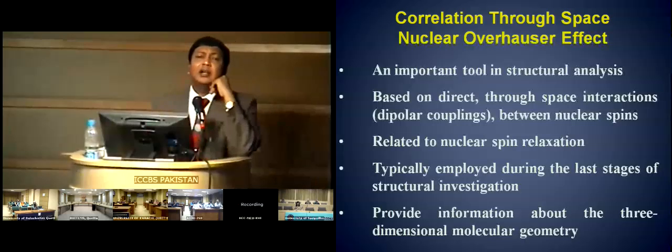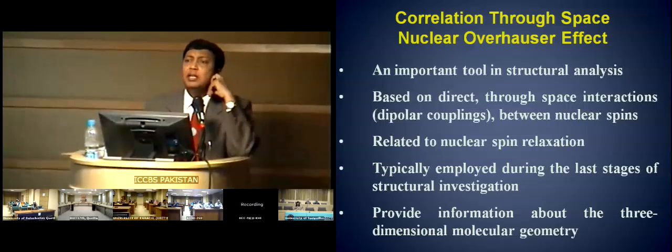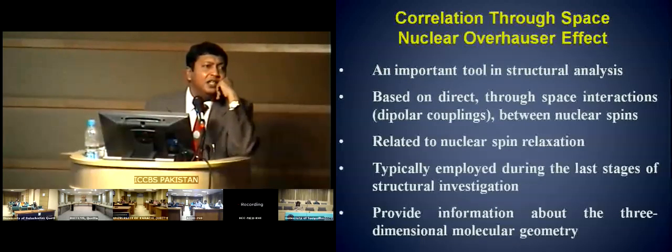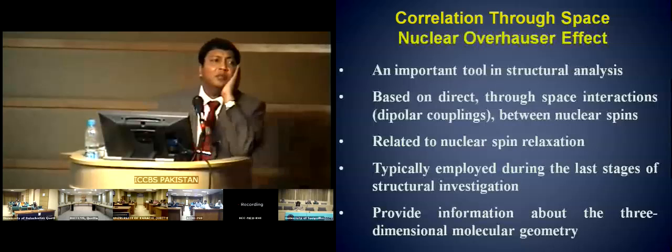We learned that a broadband carbon-13 NMR spectrum is a useful spectrum. It contains all the information, but it has a problem of multiplicity. You cannot interpret it. You have an interpretation problem.